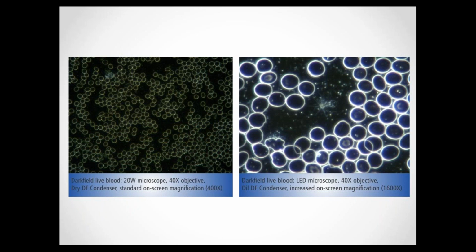So it comes down here to the components that are used within the microscope. I've tested microscopes, and I've seen microscopes where the actual gears in the focusing mechanism were made of cast iron. Usually these components are made of harder wearing materials such as brass, just because of the constant wear on these parts. So cast iron gears are of course much cheaper to manufacture, but they're really not going to last long at all. Oh, I see. Wow, that is a bit shocking.